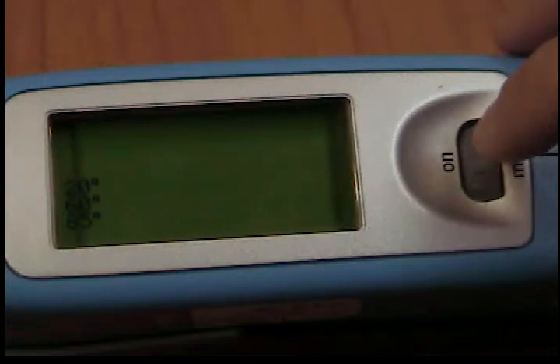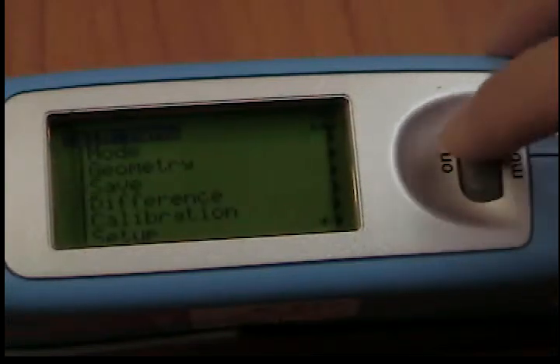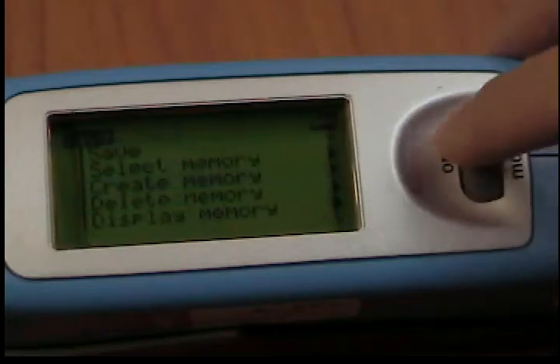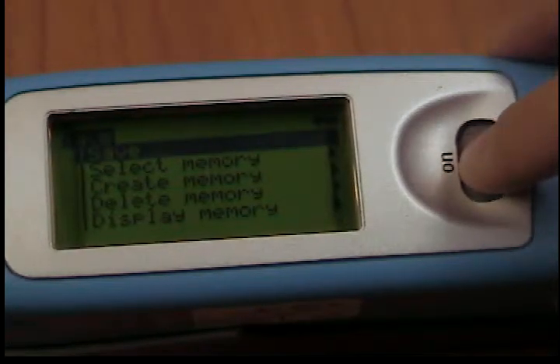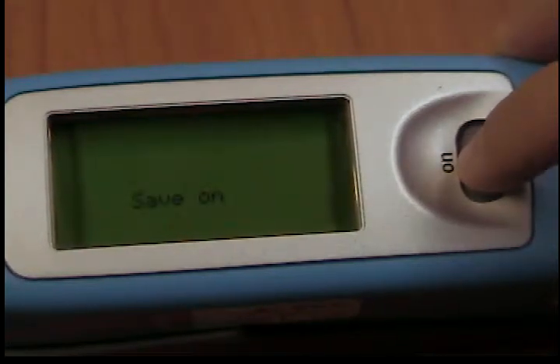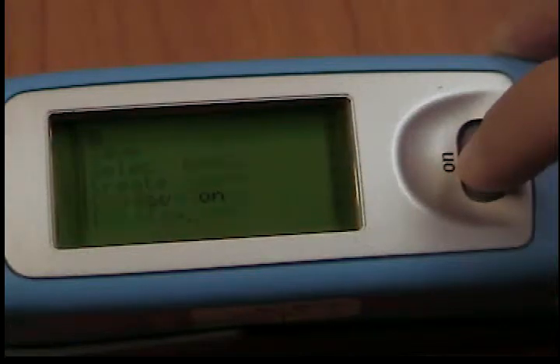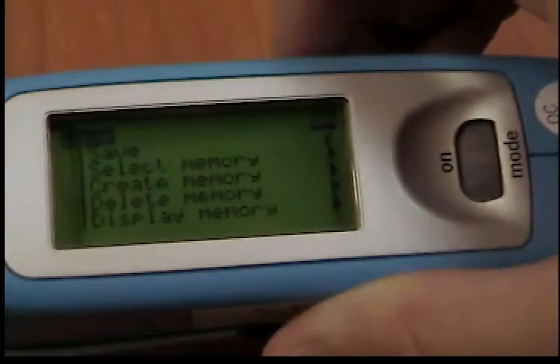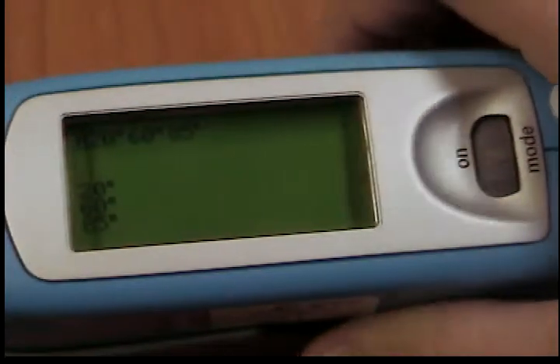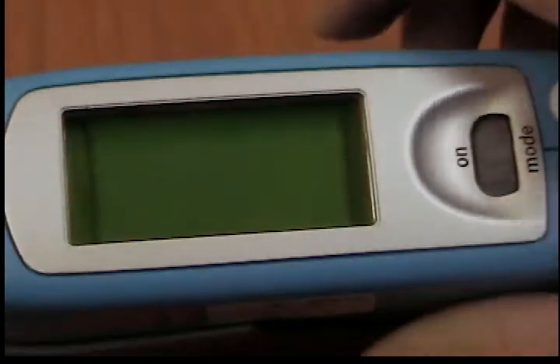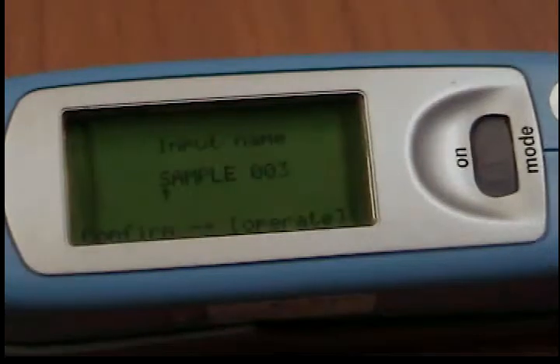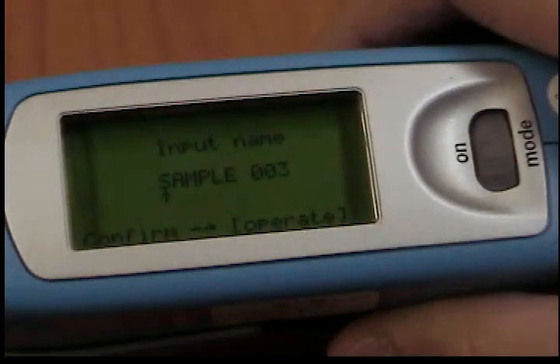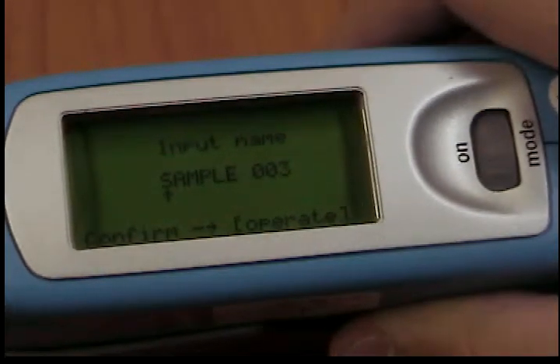When save is turned on, a name is suggested after every measurement. You can confirm it or change it. To confirm, simply press the operate key.